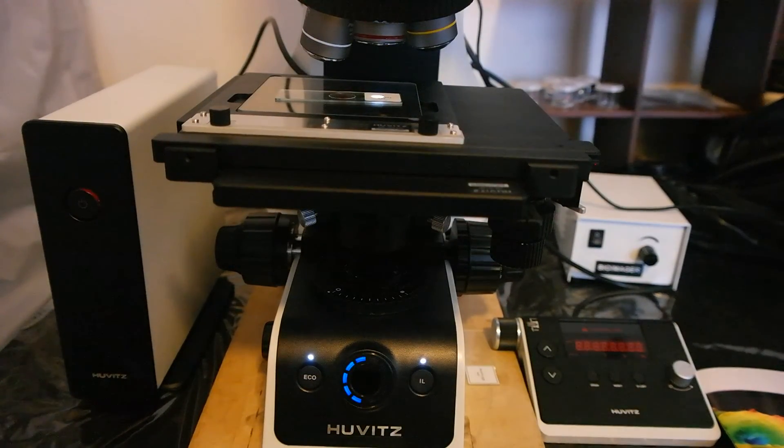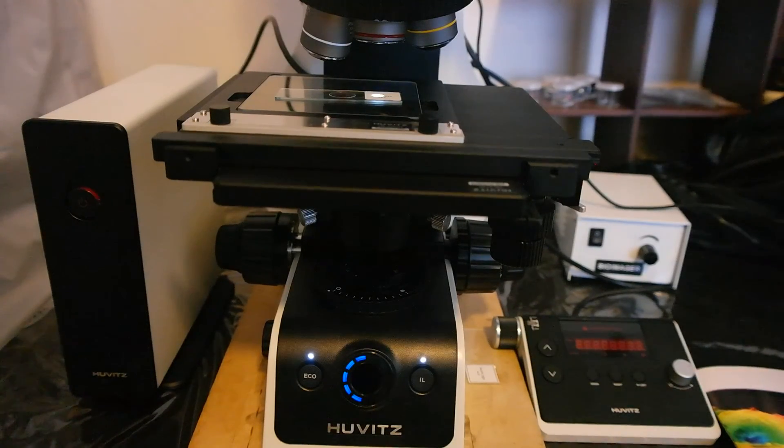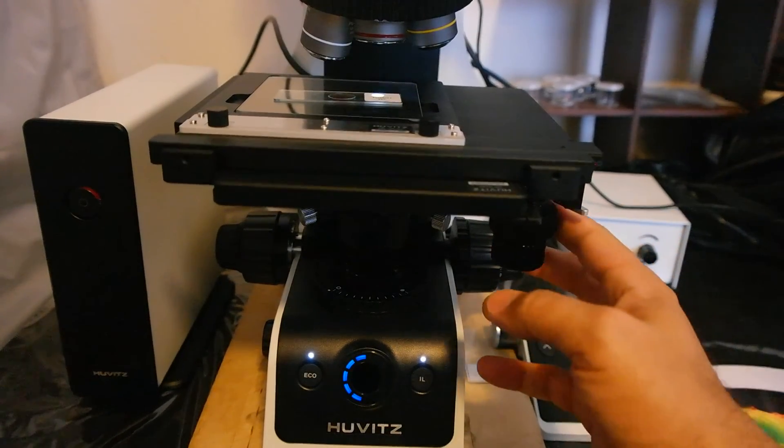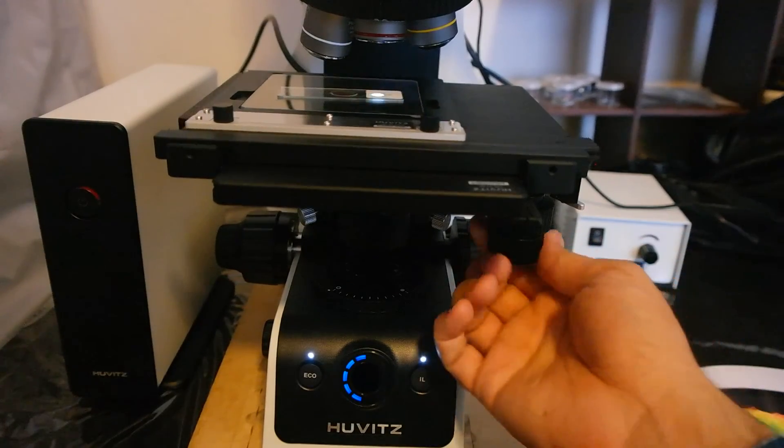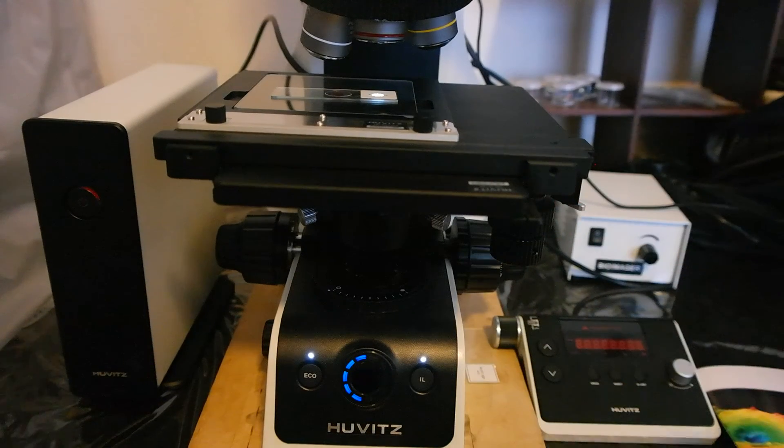Let's talk about automatic imaging with this microscope. You can have an automated XY stage. Right now I'm using a manual XY stage which is 4 inch, but we also offer automated 4 inch XY stage, so it travels 100 millimeter over X or Y, horizontal or vertical direction.